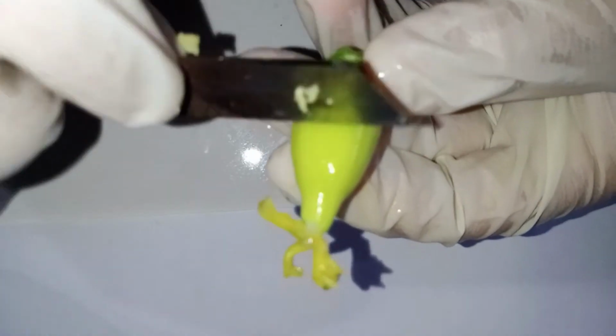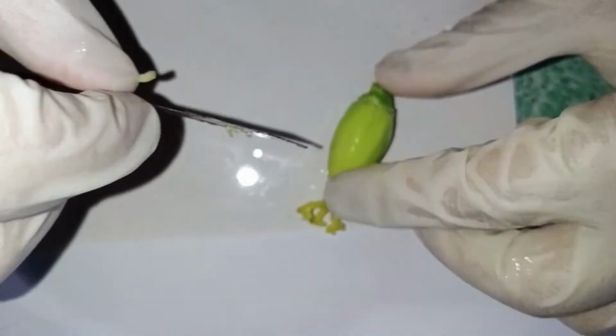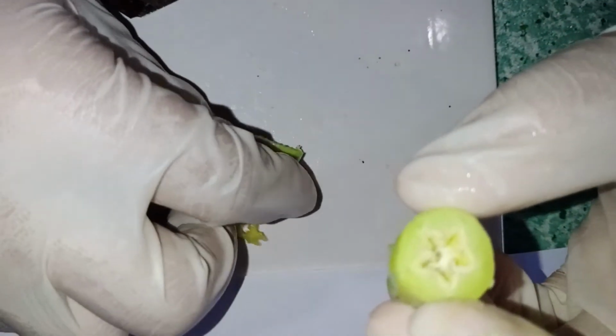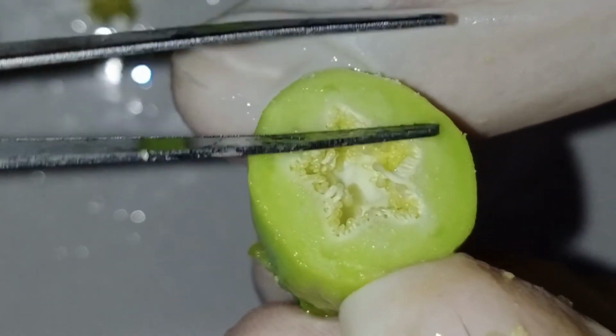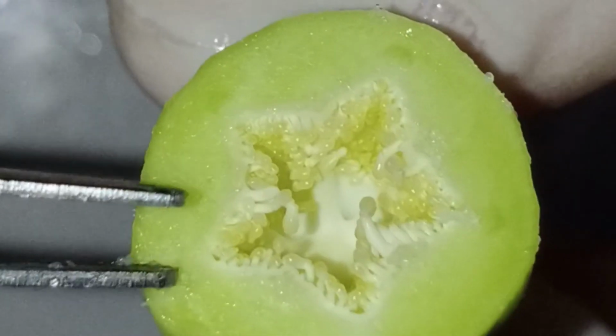Next, we want to see the transverse section of the female flower of Carica papaya. So we cut horizontally like this, and we can see here the ovary part. The outer part is the ovary wall, and then we can see the locule. The locule is the space between the ovary wall and the ovule.